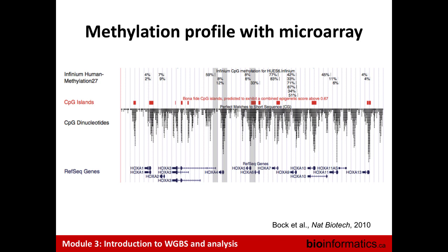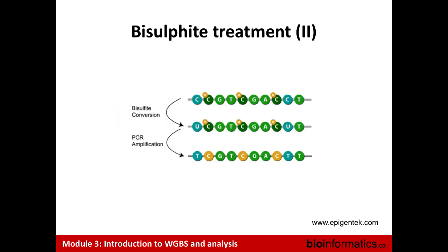It's such that you get a proportion that's going to be converted into that ratio. It's very similar to genotyping arrays, right? You have an alternative allele, and then you're measuring one versus the other. The probes themselves, I don't remember the length, but they're relatively short. Yeah, 50-mers. But I think this example shows some of the complexities, right? Typically methylation comes in clusters, and if you have a region that's dense with CpGs, I don't know the detail, but the probe design must be a bit challenging to be able to assess what's going on.